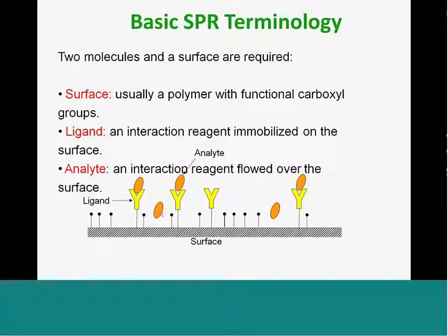In our case, we've immobilized our Ubiquitin-Binding domain, and we've injected various concentrations of Ubiquitin to get those response curves. So the ligand would be our immobilized Ubiquitin-Binding domain, and the analyte would be various concentrations of our Ubiquitin that are flowed over.